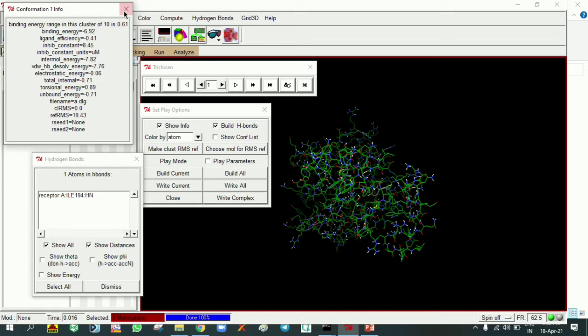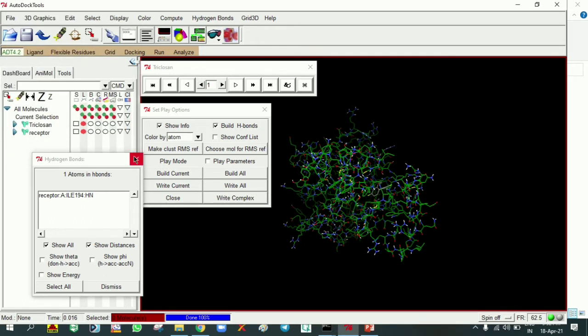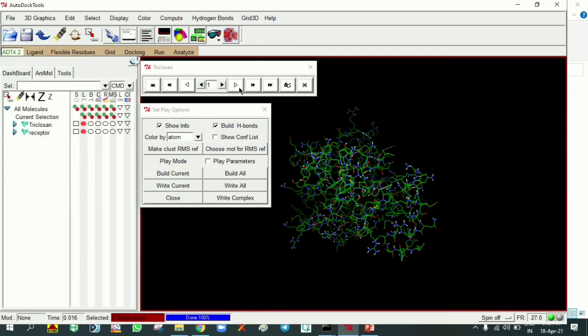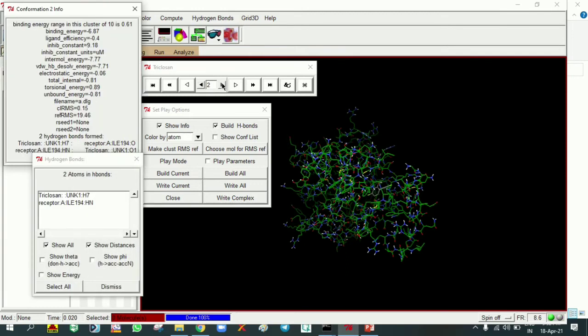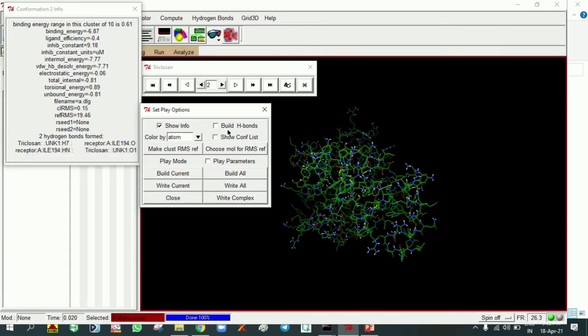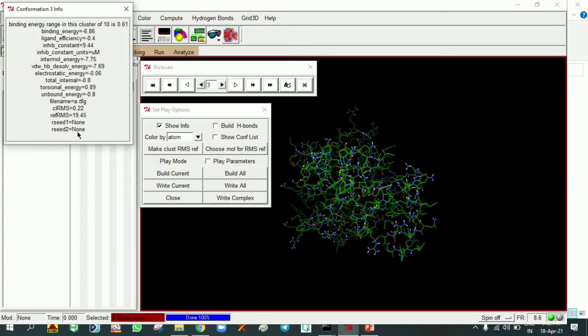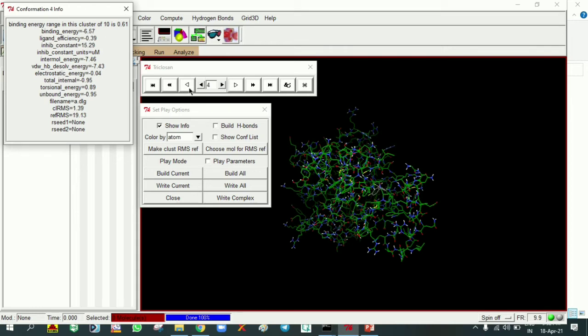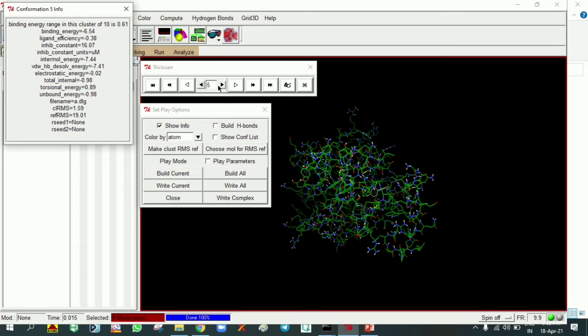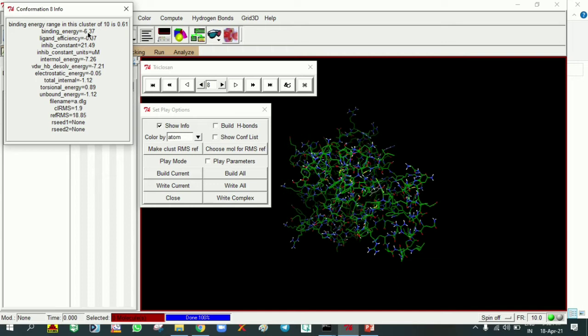I'm removing this one. We can see here 6.87 for the second conformation with linkage to isoleucine 194. Next conformation is not making any interactions, it's minus 6.86. 6.57 does not make hydrogen bond interactions. 6.54 conformation 5. Conformation 6 is 6.49. Conformation 7 is 6.38, no interactions. 6.37 conformation 8. Conformation 9 is 6.36. And last one conformation is 6.31.